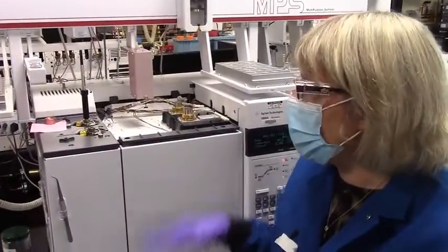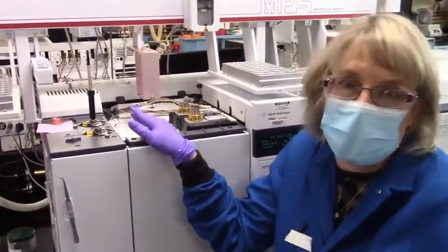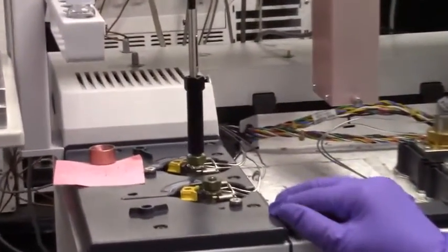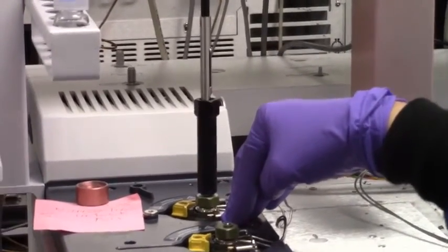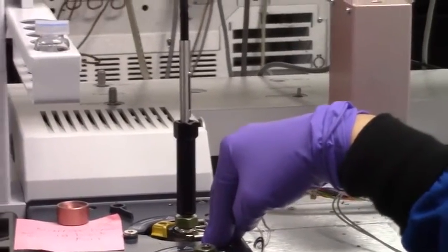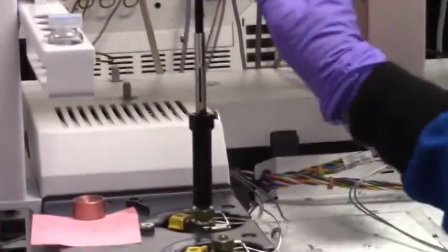Okay, so I've been conditioning my carboxen fiber I installed in the holder for about 45 minutes now. And that, like I said earlier, is to clean the fiber off and get it ready so that we can sample with it. So at this point, I've got it in a hot GC inlet. That's what I'm using to condition the fiber. And my inlet I've set to 300 degrees centigrade. I have flow going through it. That's very important. You want to have flow going over the fiber while you're conditioning it. And I've exposed the fiber by pushing down on the plunger.